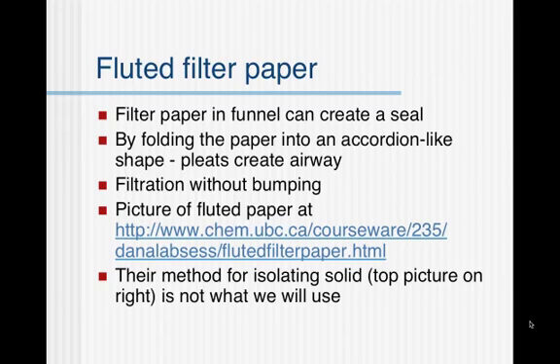There's a picture of fluted filter paper at the website that's shown below, and you can look at that, but typically you're going to learn how to best fold filter paper as you get into the laboratory. The method they use for isolating the solid in that one is not typically the one that's used in our laboratories.